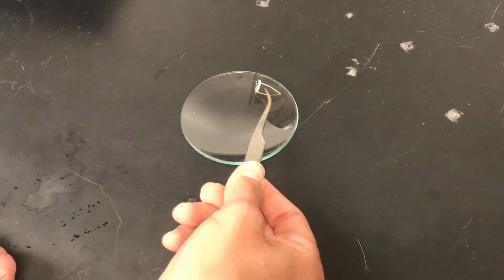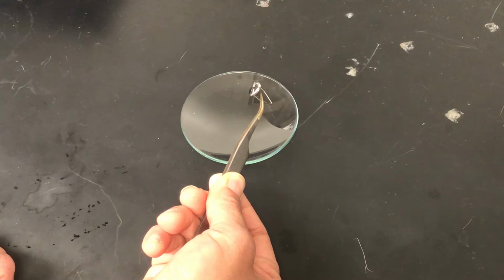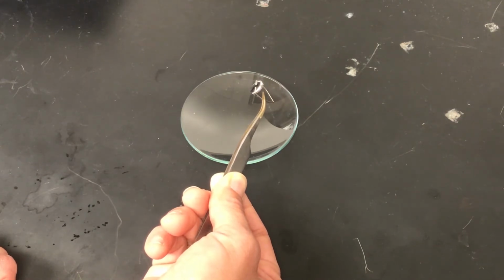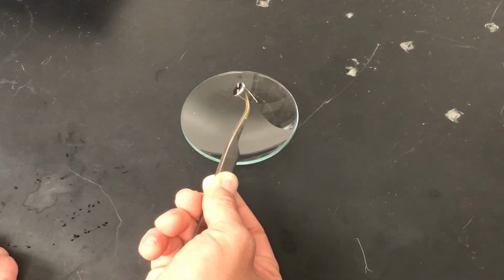One thing I want to point out is the bottom of this pan. Notice that it has a ridge line of platinum metal, basically the handle of the pan. This is going to go in a groove on the sample loading arm on the instrument itself. So we need to be aware of where this line is and how to load the pan on correctly.